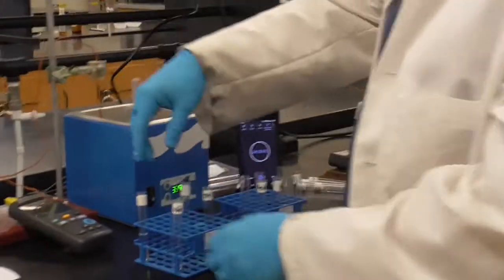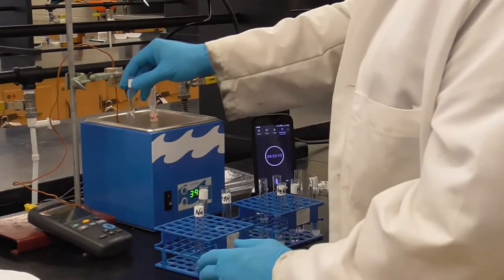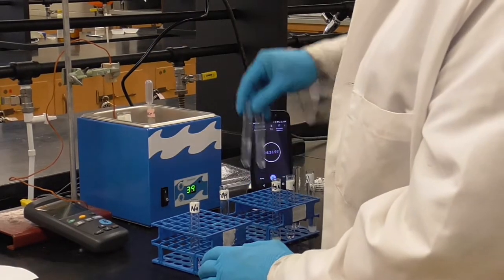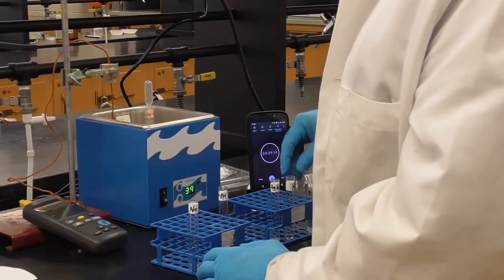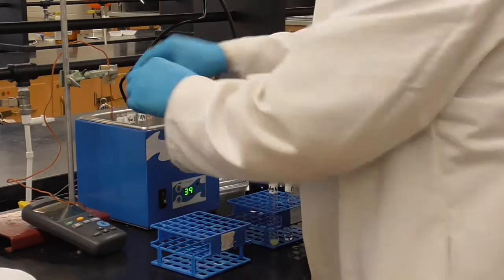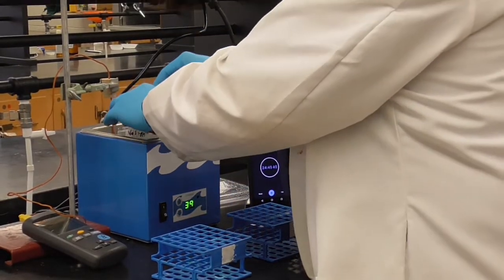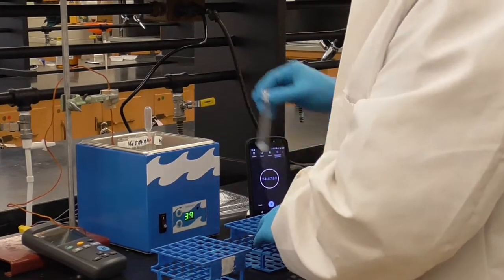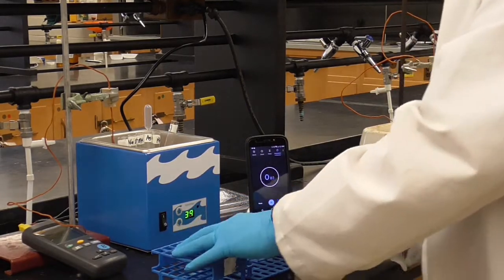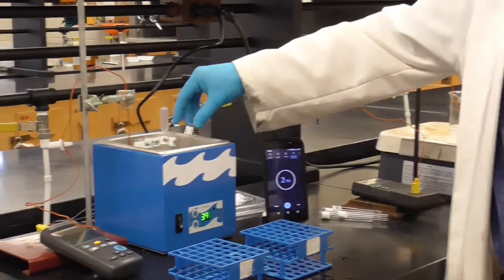All right. So really these starches are all the same. I'm just going to go ahead and line them up right along the back here. We have 5 test tubes of starch, and then sodium chloride, ethanol, the silver, the mercury, and the lead. Okay, and we'll give those 5 minutes to come to temperature.